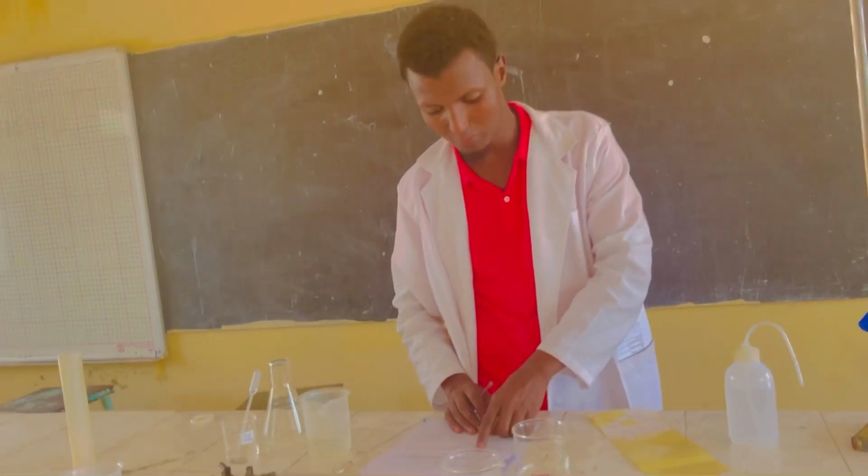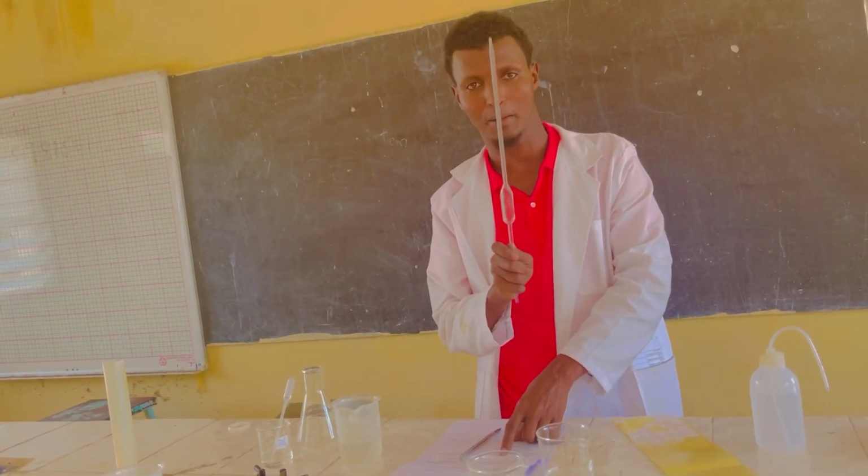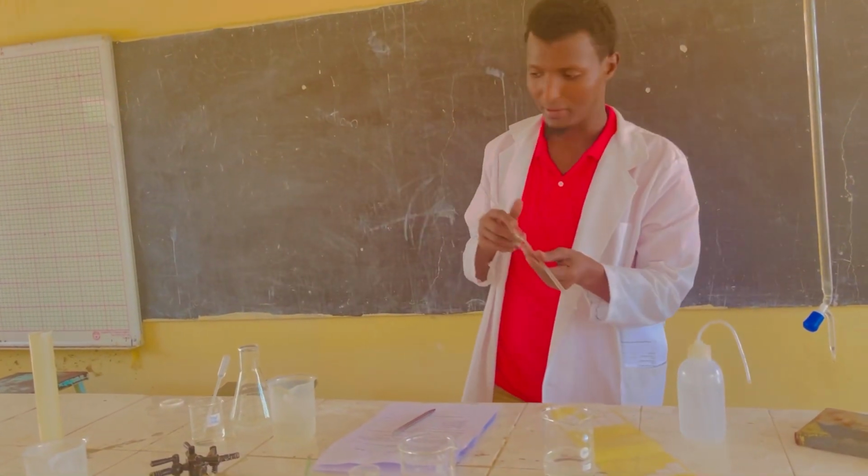Pipette 25 centimeter cube of solution W. I'm going to use my pipette and then pipette the W that I prepared. So I want to pipette that.